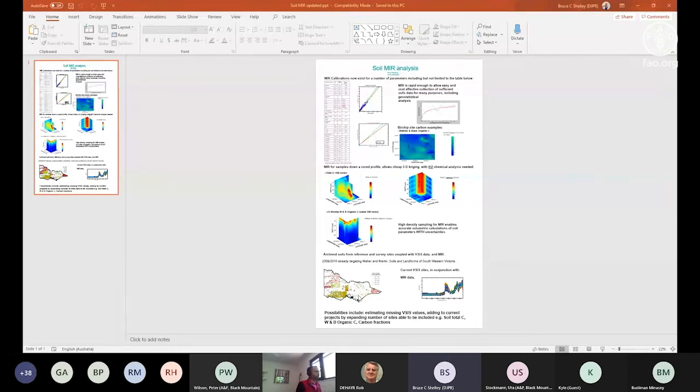Sample prep, we were using the SCARP protocol before it was a SCARP protocol. It was the standard way we were preparing samples. As I've mentioned in other forums, there's a relationship between the wavelength that you're measuring and particle size. That's pretty well known, and it does mean that for reliable scanning and reliable results, you really need to use a fine grind. So we just use a zirconia swing ring mill, and yes, it does increase the time and the cost.